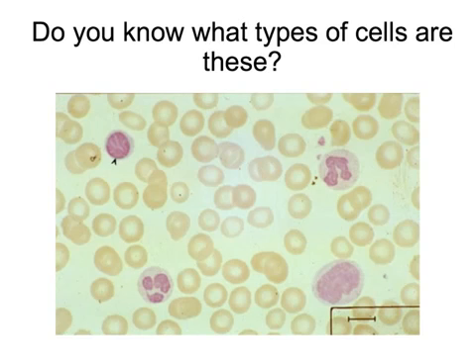Well, let's see how you did. Hopefully you identified these right here as the erythrocytes. We do want you to use the term erythrocyte as opposed to red blood cell. Each of these structures that we see is a leukocyte, or a white blood cell. Here we're going to have our lymphocytes with our very large nucleus. Here we're going to have a monocyte, not the clearest monocyte, but it is a monocyte. Right here and right here we would have our neutrophils.